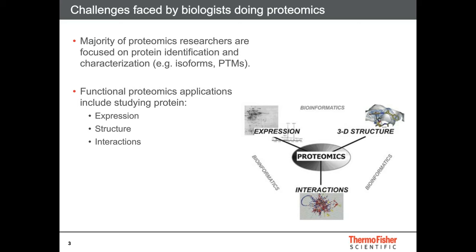Traditional methods used to prepare protein samples for MS analysis require enzymatic digestion of proteins to peptides. This approach, commonly referred to as bottom-up proteomics, relies on peptides for database searching and subsequent protein identification. However, much of the original protein biological context is lost during this type of sample preparation.